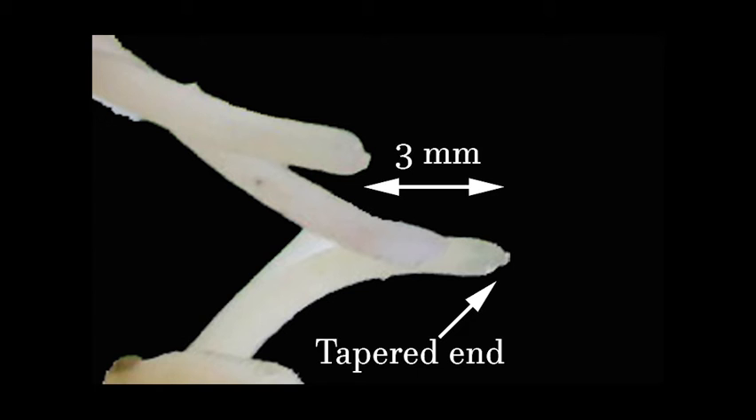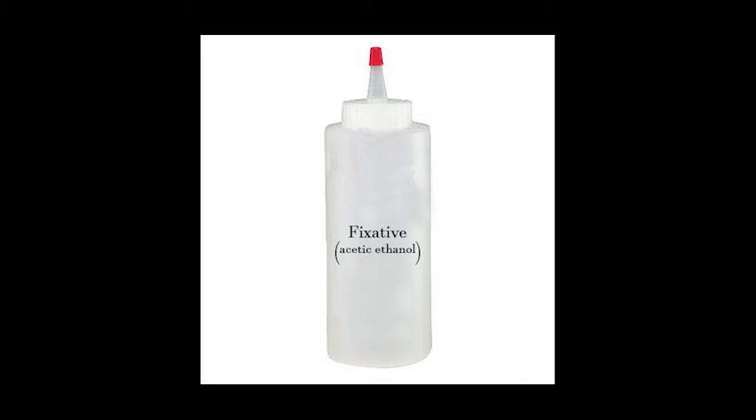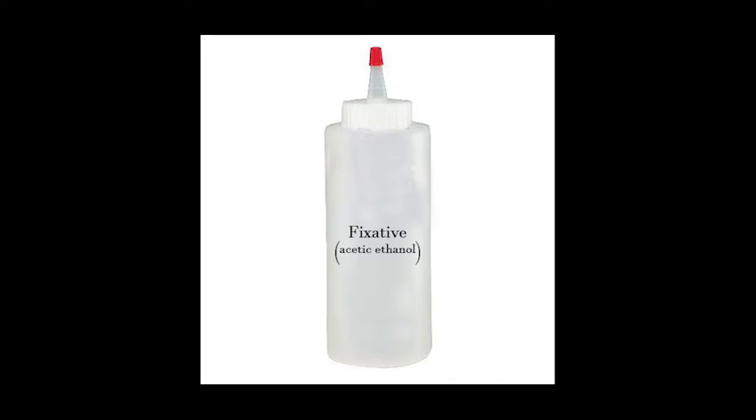With the razor blade, cut off and save the last three millimeters of the root tip. Discard the rest of the root. Cover the root tip with four drops of fixative and wait five minutes. Drain the liquid from the slide using a paper towel. This fixative will stop cellular activity.